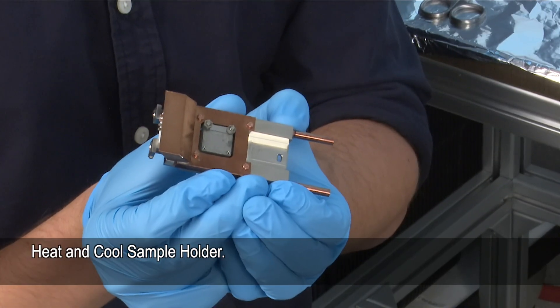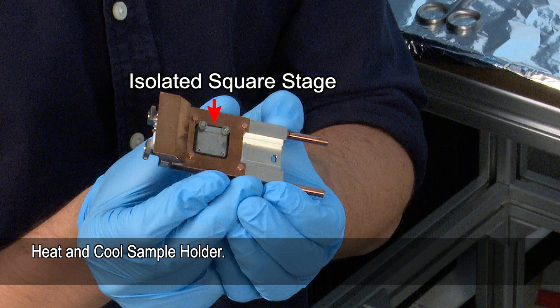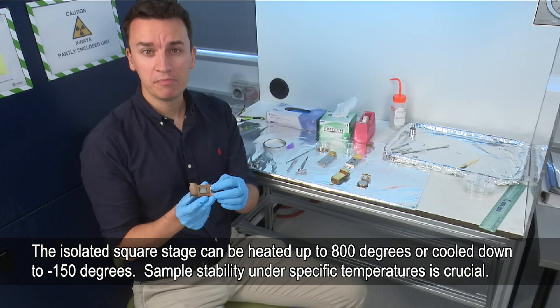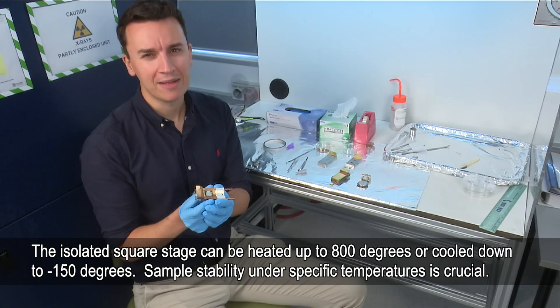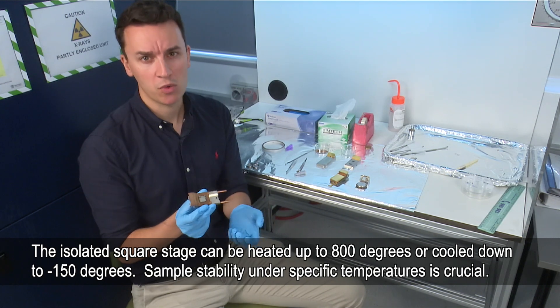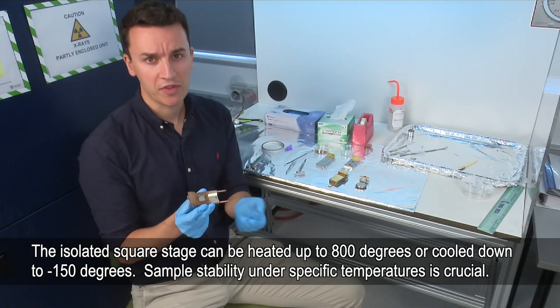This is the heat and cool sample holder — it's a little different to the others. It has an isolated square stage that we can either heat up to about 800 degrees or cool down to minus 150 degrees. Of course, the temperature we heat or cool to, we have to make sure that the sample is stable under those conditions.